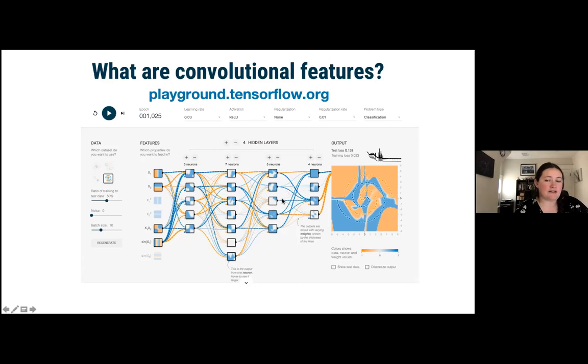And the idea is just that by strengthening or weakening the connections between all of these, we can actually make some pretty valid models that understand what's going on. This is clearly not a perfect spiral, but it's not an imperfect one either. It definitely is starting to get the idea of a spiral. And so by taking what these filters look like and the mathematical numerical values of these weights, we can treat those exactly the same way we treat a texture feature or a Zernike feature and use it for morphological profiling prediction.